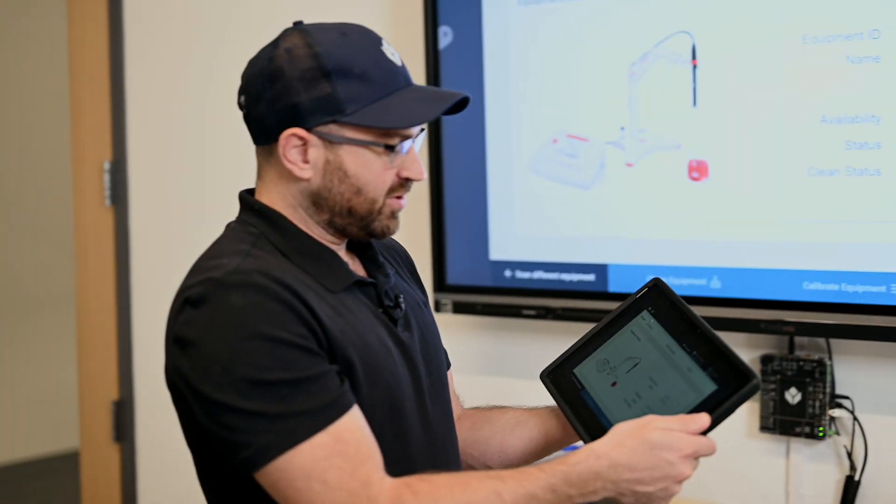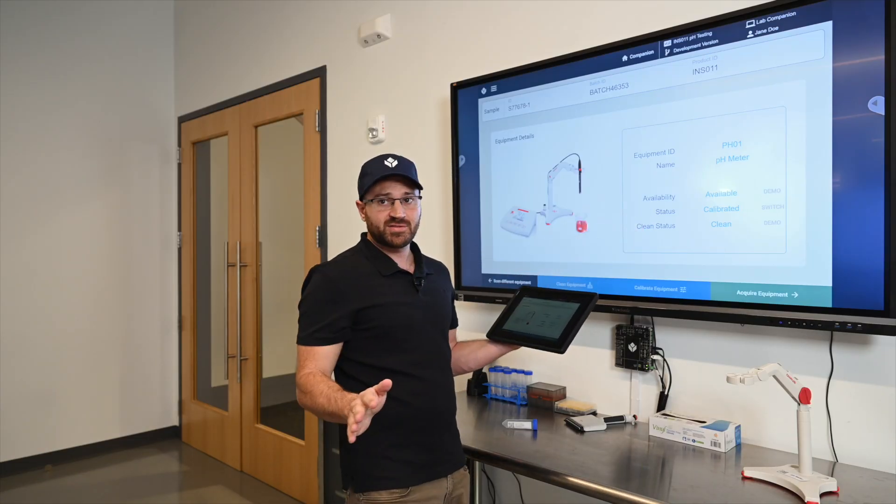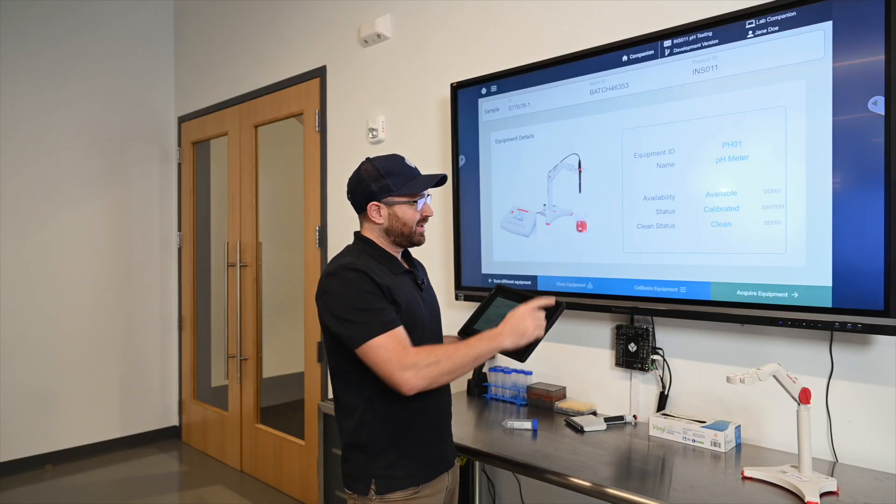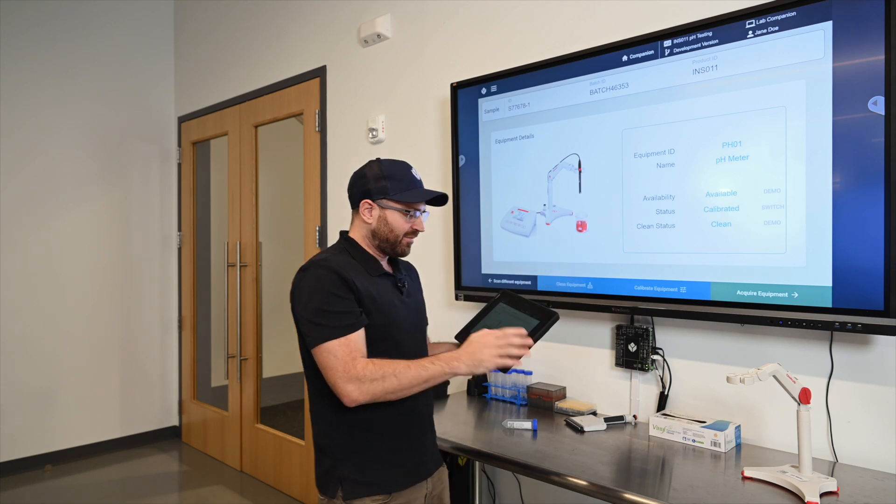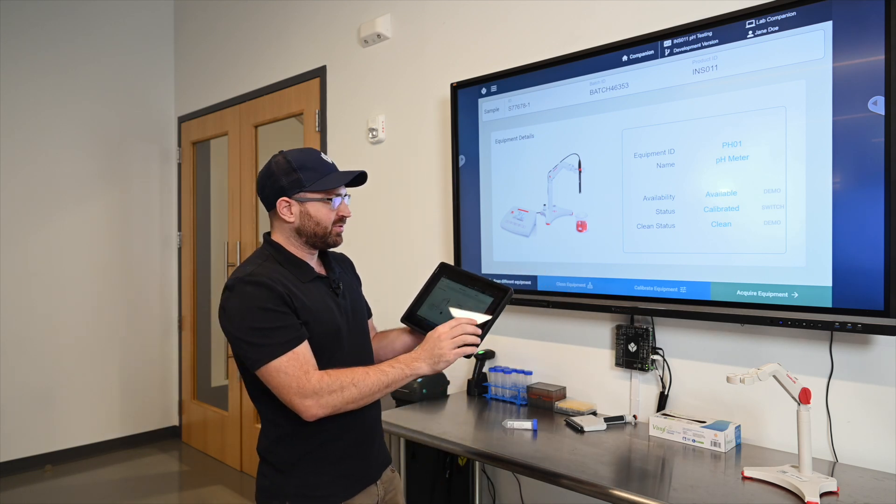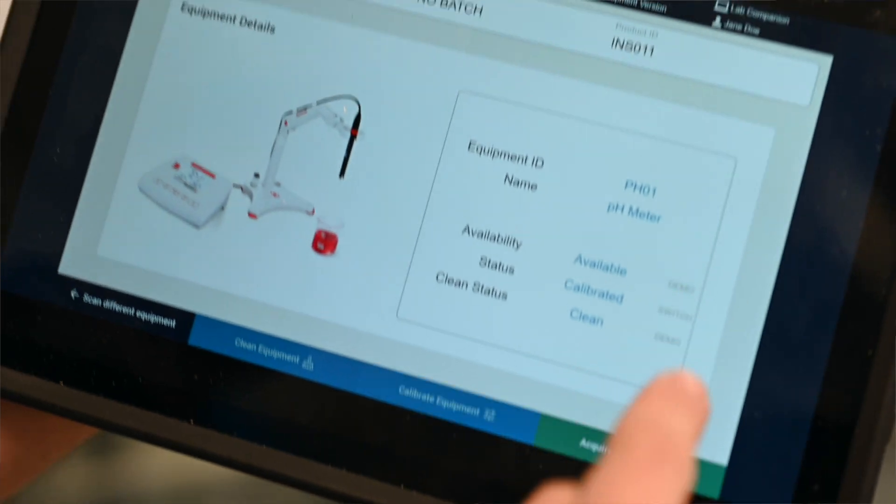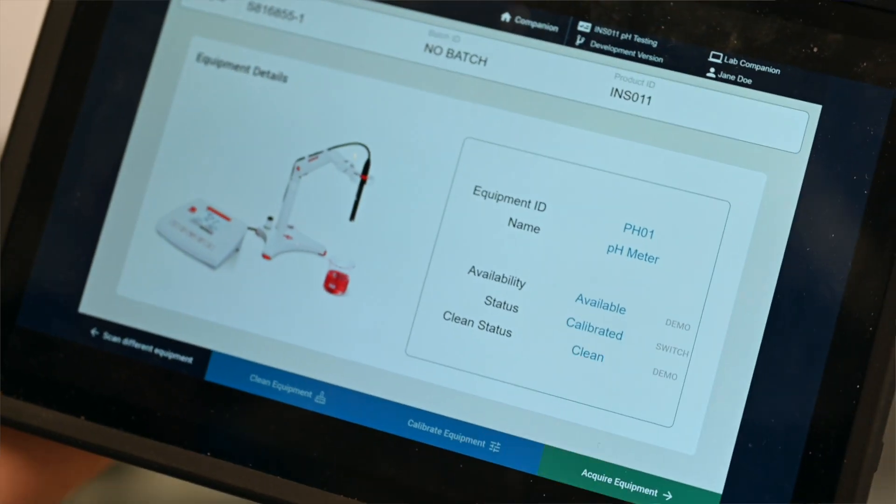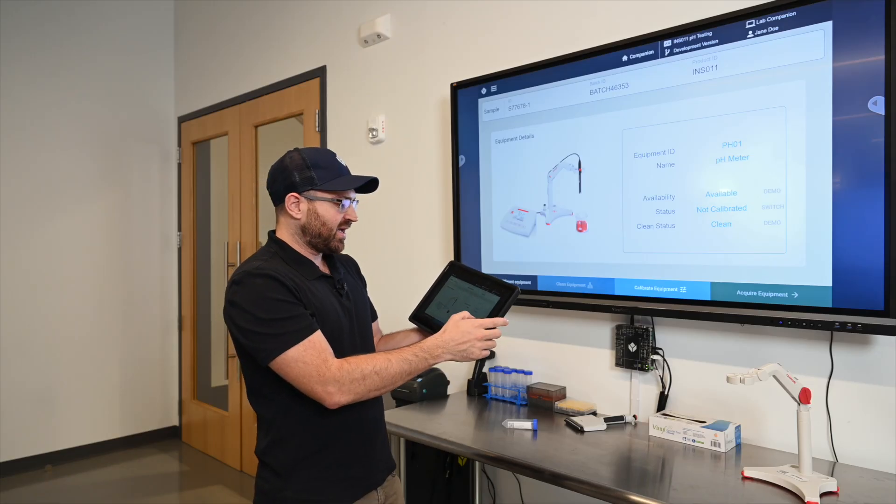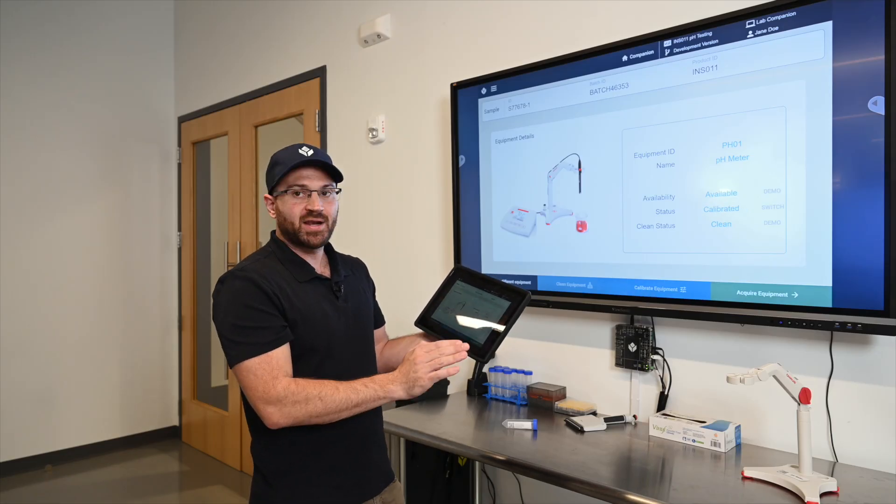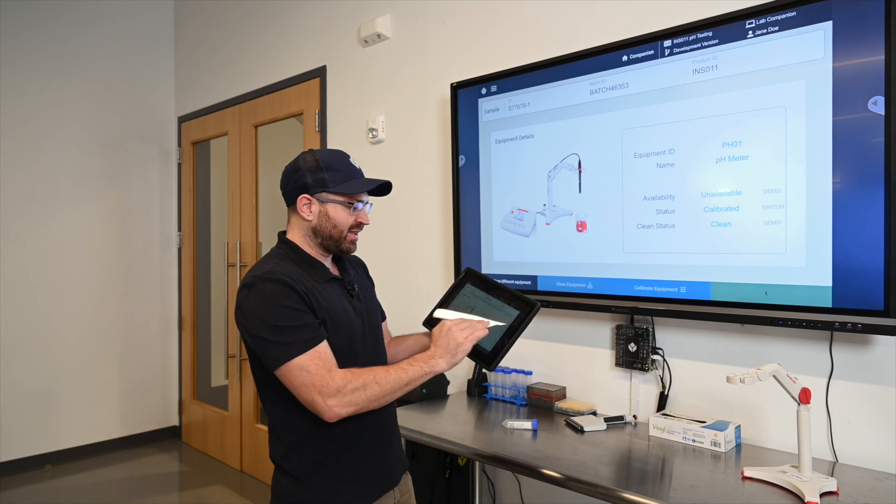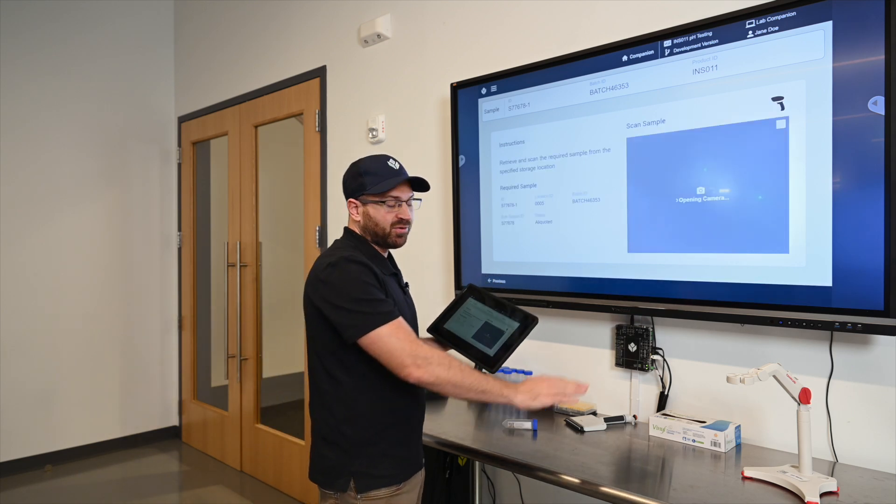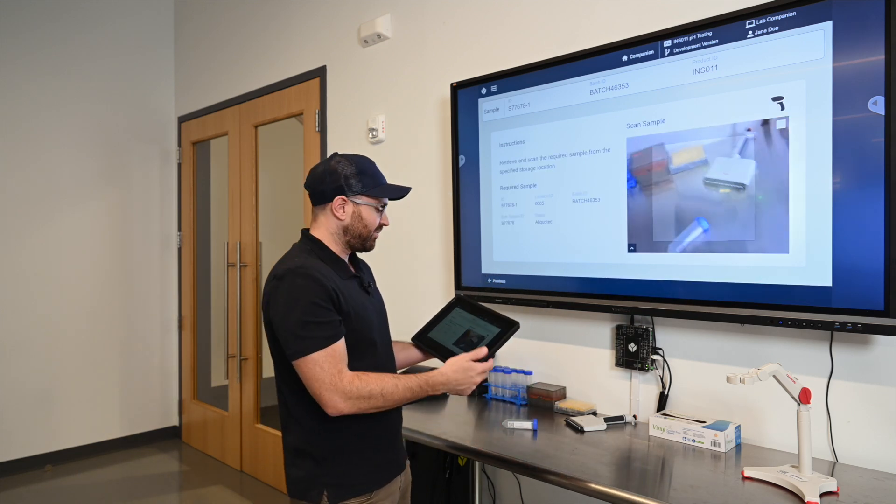To do that it has to be available meaning no one else is using it. It has to be calibrated and it has to be cleaned. If it weren't calibrated I wouldn't be able to acquire the equipment. I'd actually have to jump into a different procedure for calibration. But instead for demo purposes I'm just going to acquire the equipment. So now I've made this equipment unavailable and no one else can use it while I go get my sample.